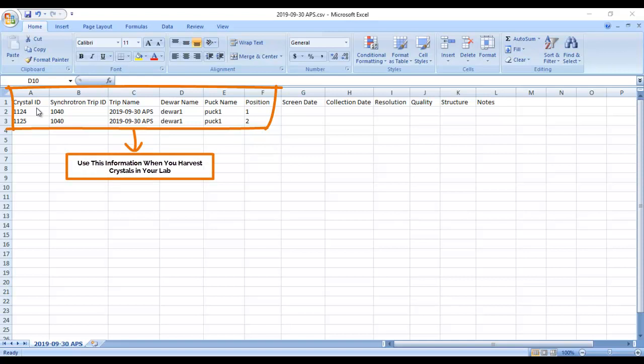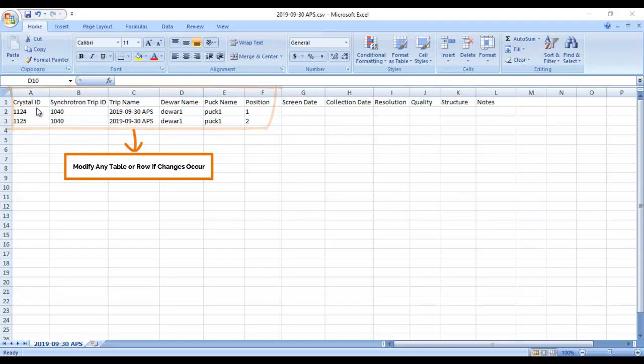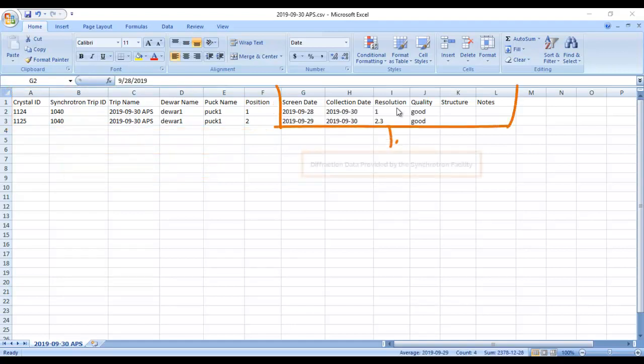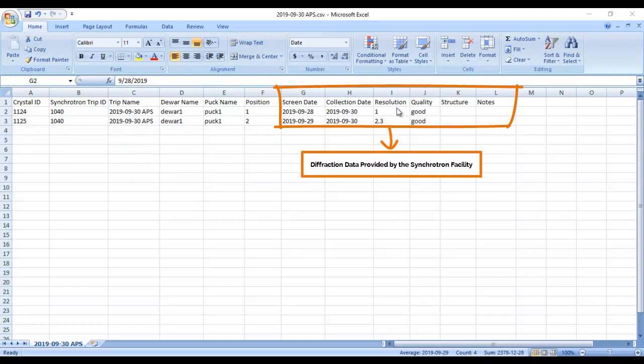Should any of your crystals not make it through the harvesting process, you can easily update your crystal data in the editable CSV report and then upload that data into RockMaker. You can also do this after you've collected your diffraction data. Add the data to your CSV synchrotron trip report and import it into RockMaker. When you do, RockMaker will automatically update all of the affected crystal records so that all of your data is accurate.